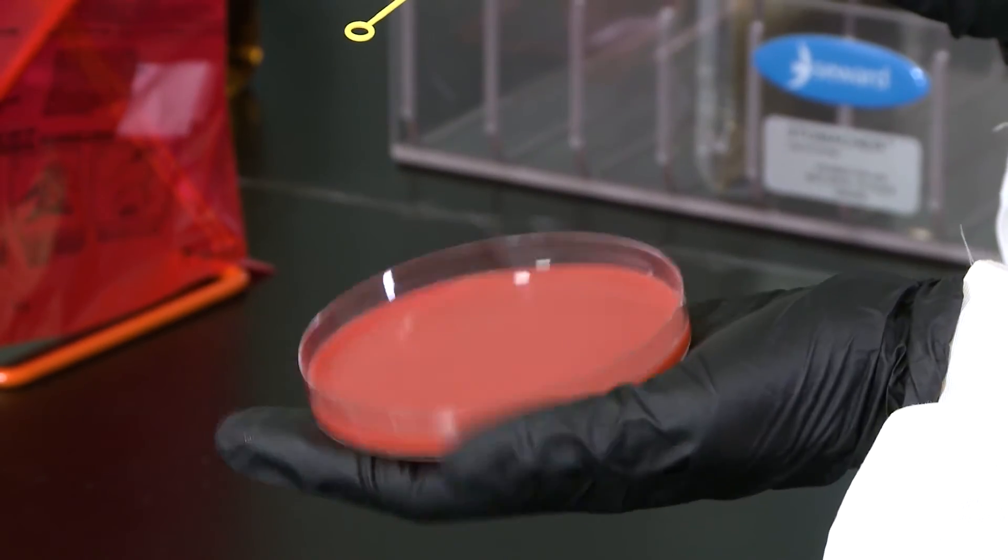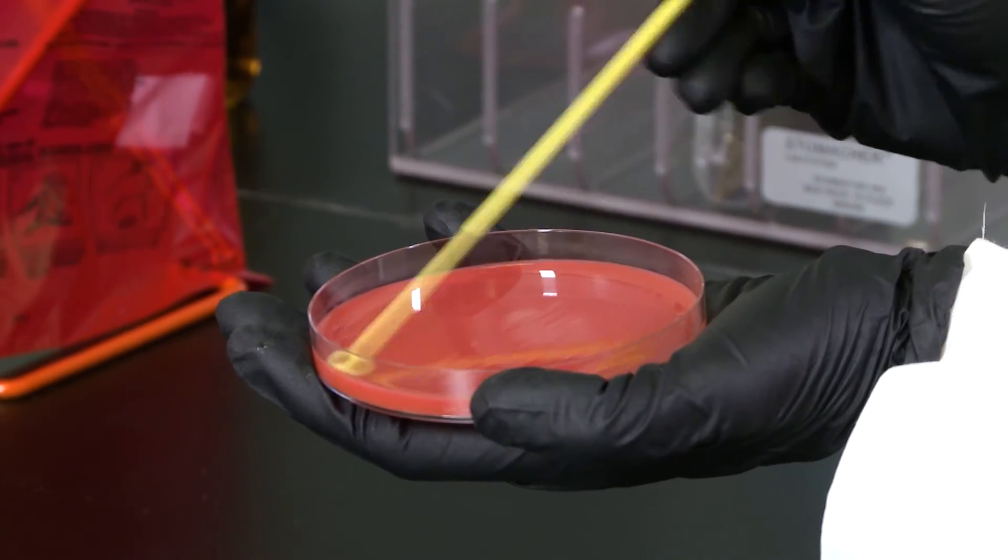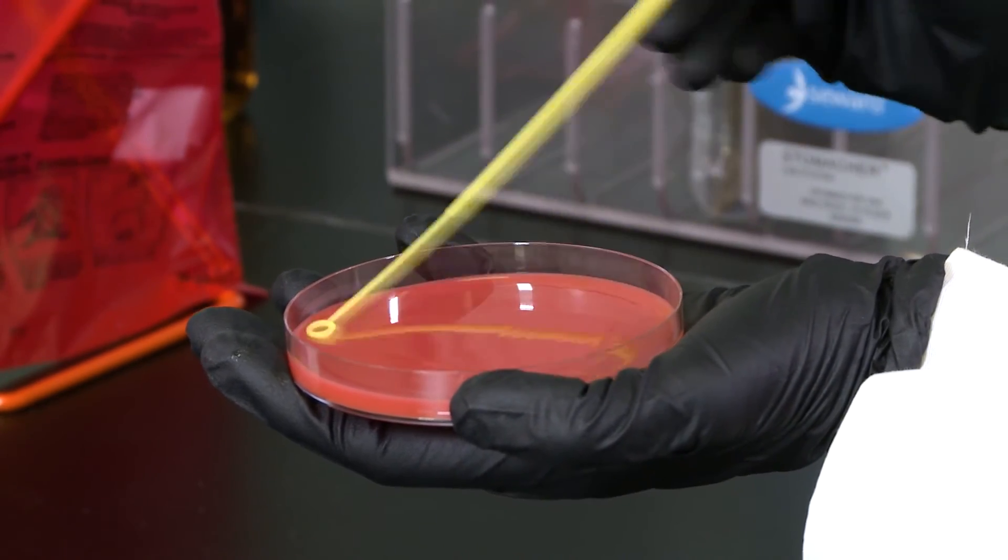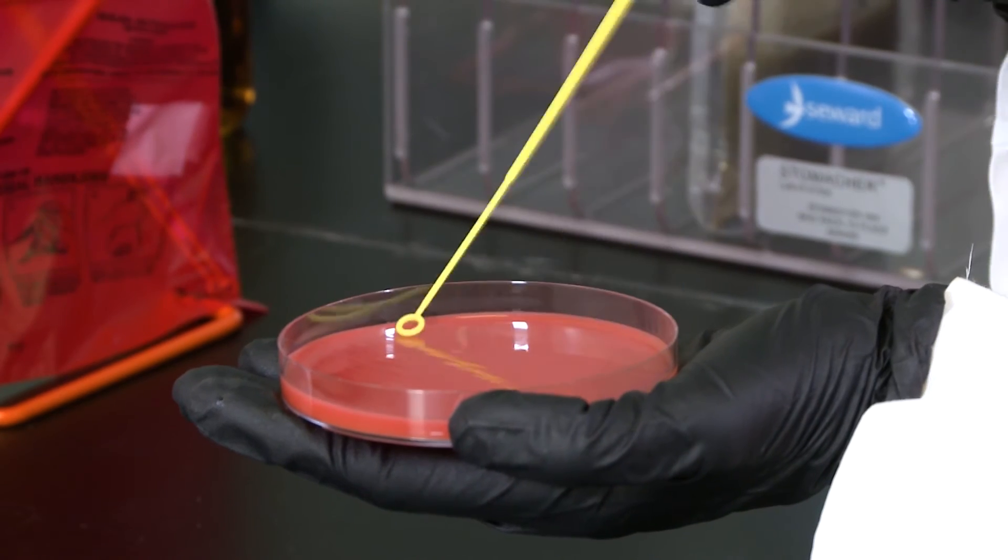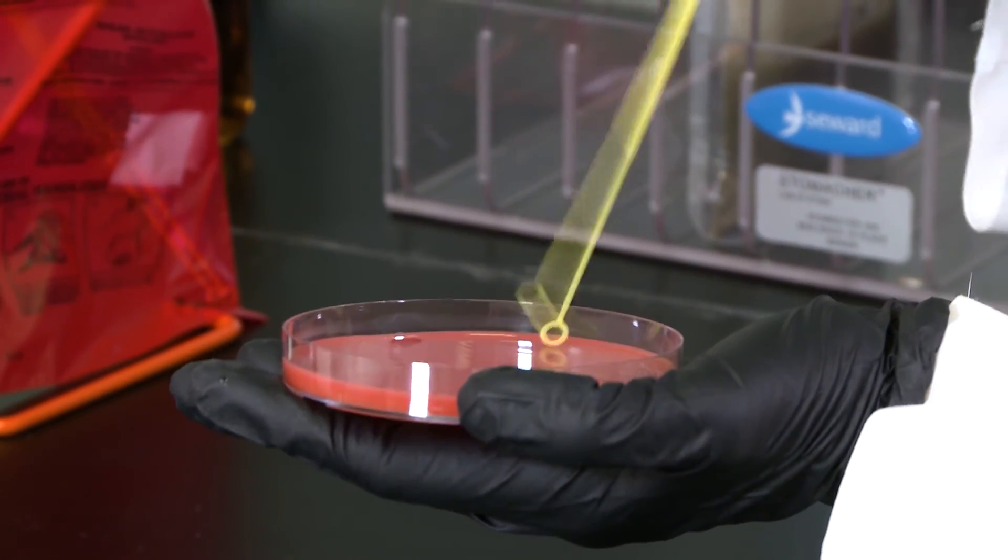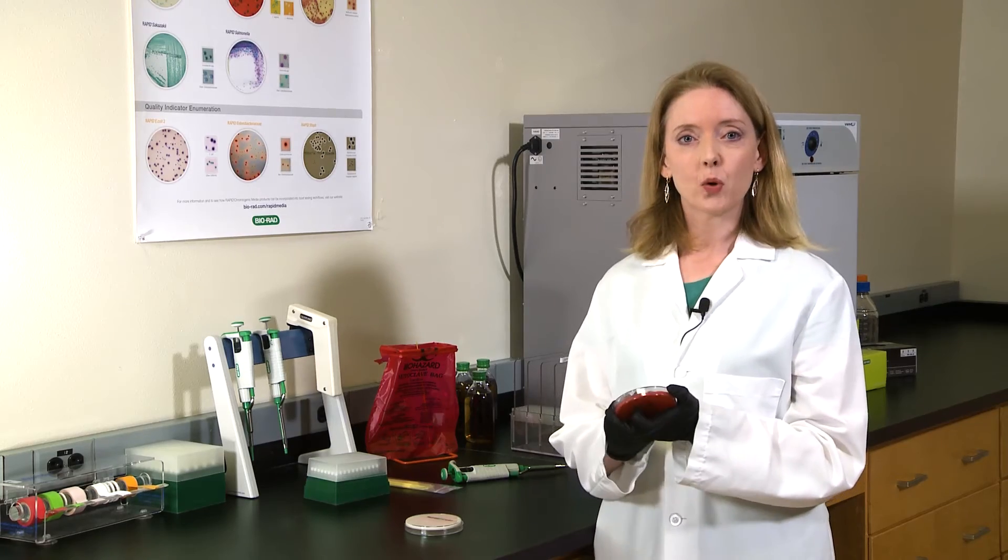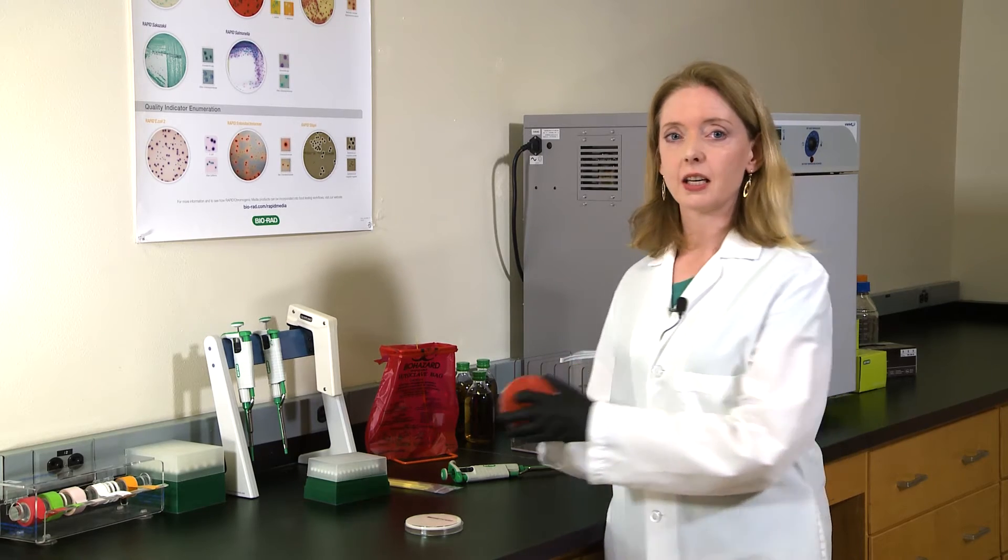Turn the plate one quarter turn and streak across the other half of the agar surface in relatively tight streaks over the whole dish from the edge of the previous spread. It's very important to obtain well isolated colonies for further confirmation.